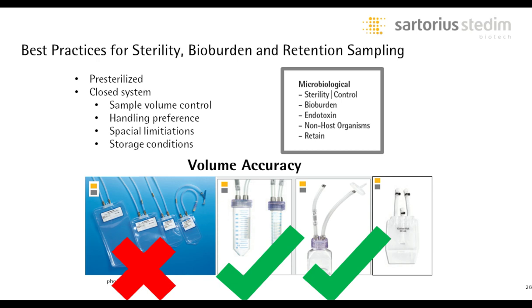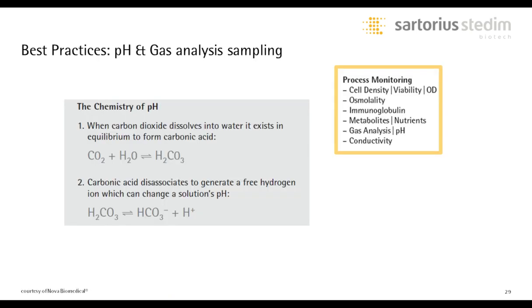Really, we find that if you give an operator a 50 ml bag and ask them to take a 10 ml sample, you're going to end up with something much closer to 50 ml than you would 10 ml.